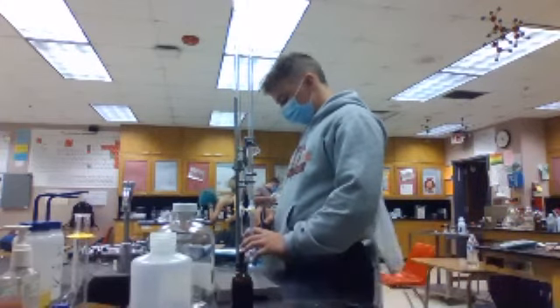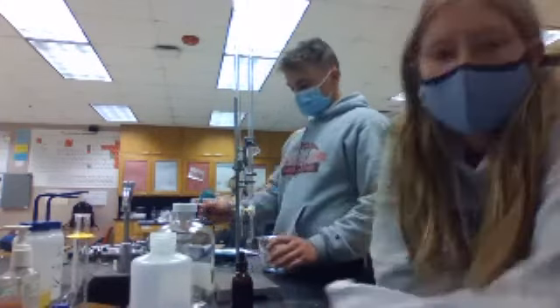11.85. Okay, so he said we should stop when the graph levels out. And he said it should be around like 12, like pH of 12. So you guys just let me know when it levels out. Does that make sense? Yeah. Okay.